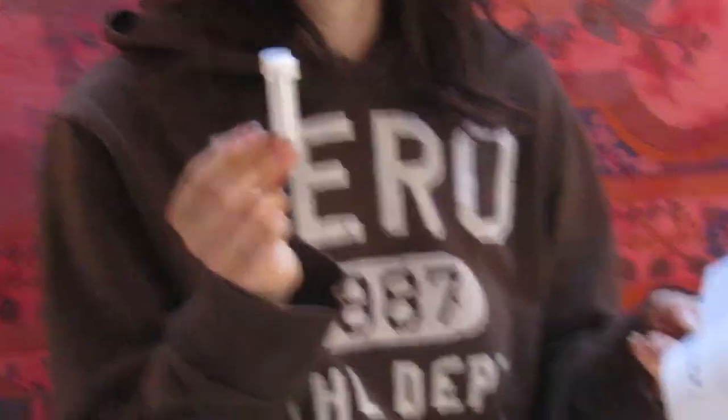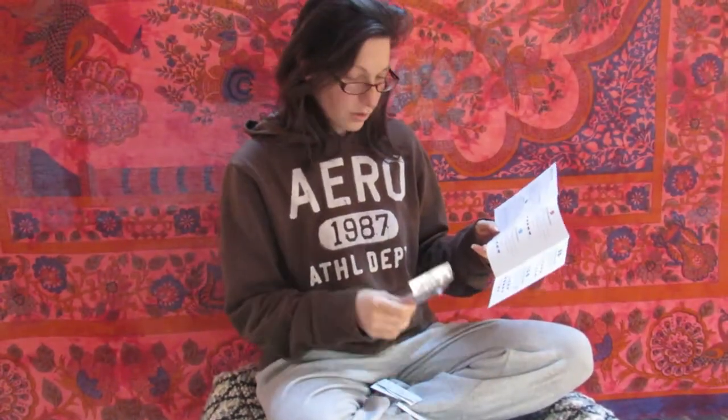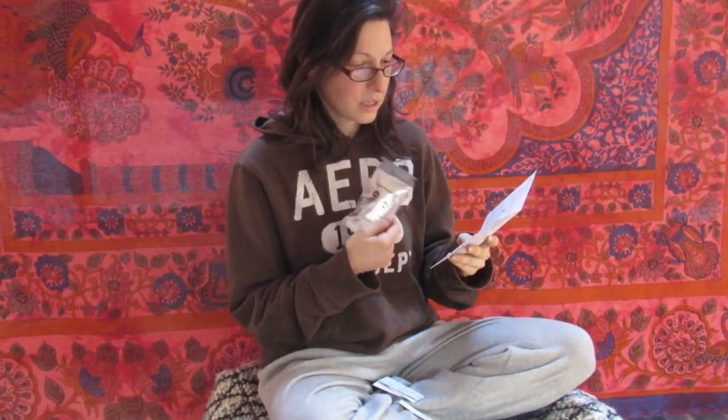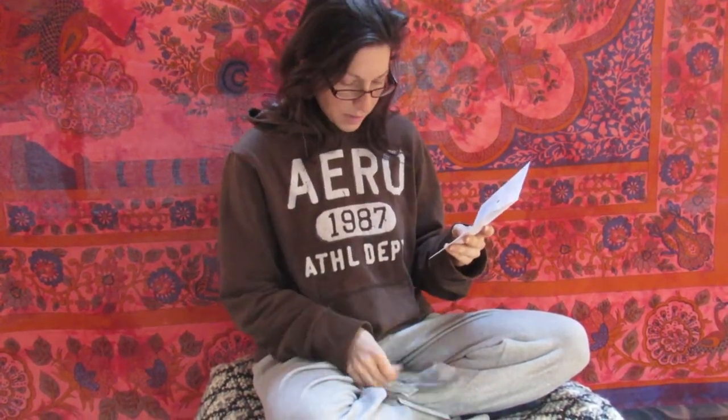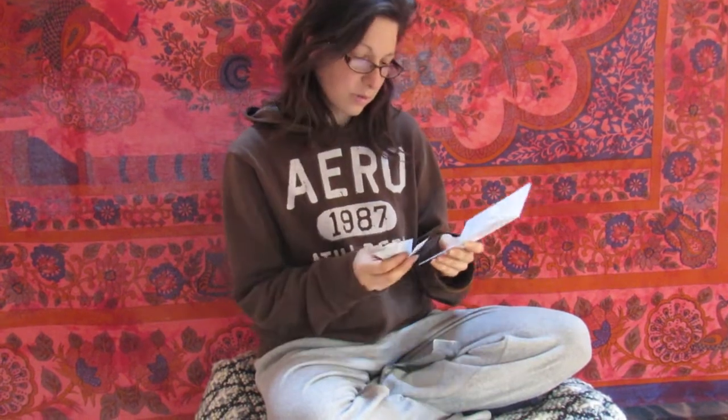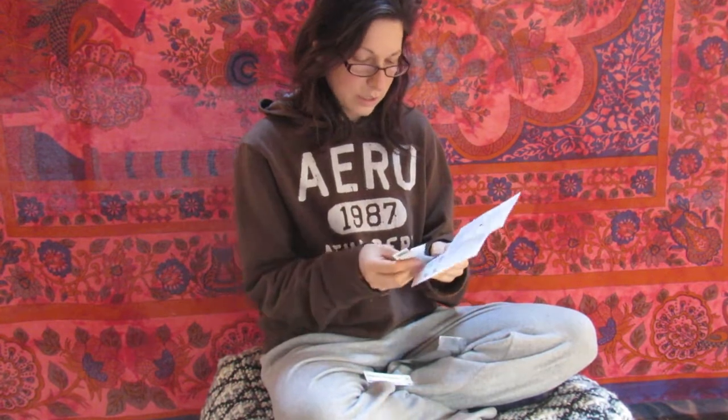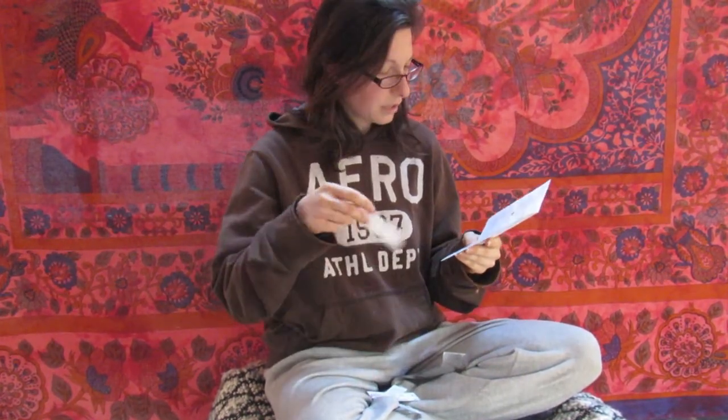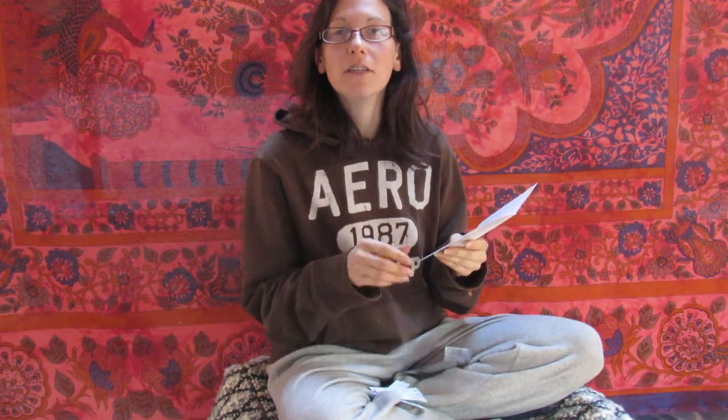That one's kind of the only one you have to wait for. There's also a pesticide and lead test that you have to do into a vial and that one takes a little bit longer too. But besides that, the other ones are really easy. There is a hardness test, pH test, chlorine test, a nitrate and nitrite test, an iron test, a copper test. Those are just little papers that you put into the water and check.